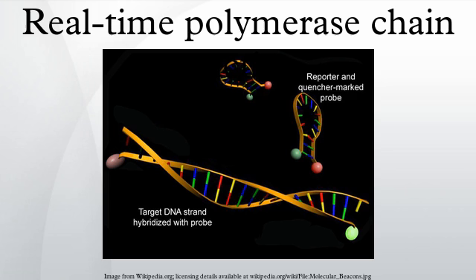Quantitative PCR is carried out in a thermal cycler with the capacity to illuminate each sample with a beam of light of a specified wavelength and detect the fluorescence emitted by the excited fluorophore. The thermal cycler is also able to rapidly heat and chill samples, thereby taking advantage of the physicochemical properties of the nucleic acids and DNA polymerase. The PCR process generally consists of a series of temperature changes that are repeated 25–40 times. These cycles normally consist of 3 stages.